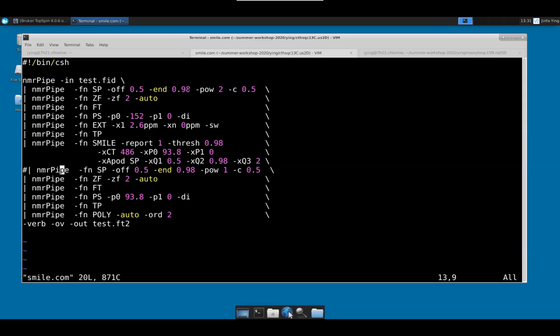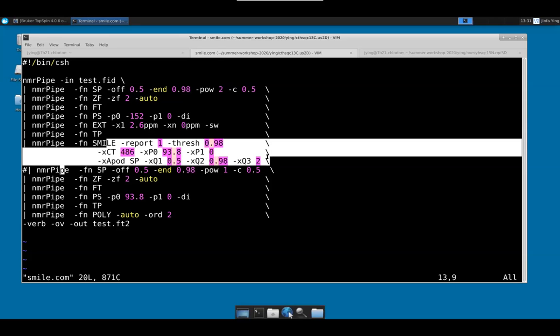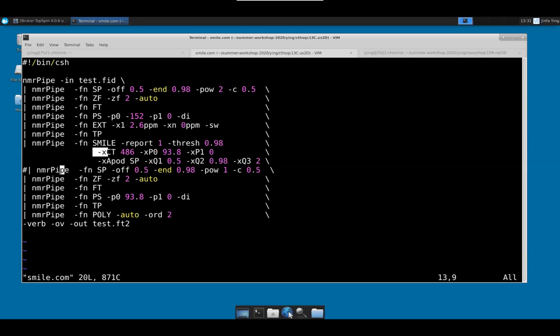I see. And it can be done. I programmed it such that you don't even need to generate a sampling schedule. Okay? I see. So I can detect that when there's no sampling schedule, you really have to set some XT, or the default is 50% anyway. I know that you want to do linear prediction type of reconstruction, and it will do it that way. So can this be used on a data set that is acquired linearly in T1?